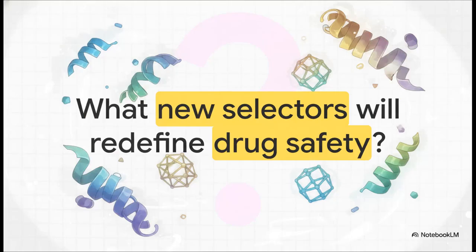So, I want to leave you with this final thought. As our pharmaceutical medicines get infinitely more complex, utilizing larger and far more intricately folded molecules, how will chiral chromatography evolve to keep up? What new, unimagined chiral selectors are we going to need to design to keep pushing the boundaries of human safety?